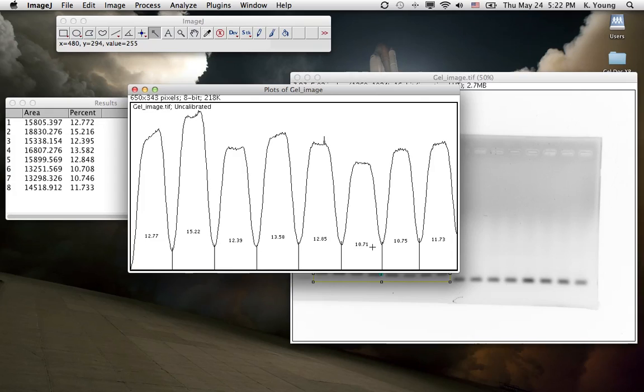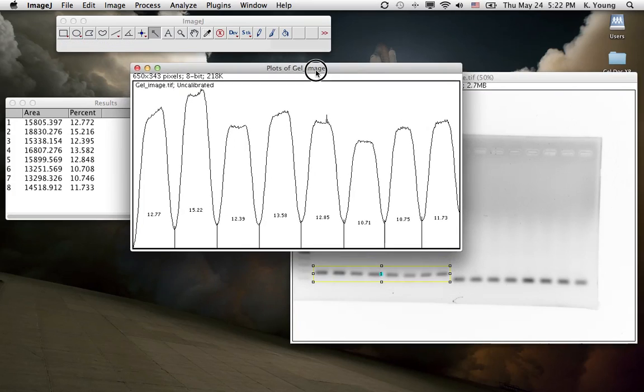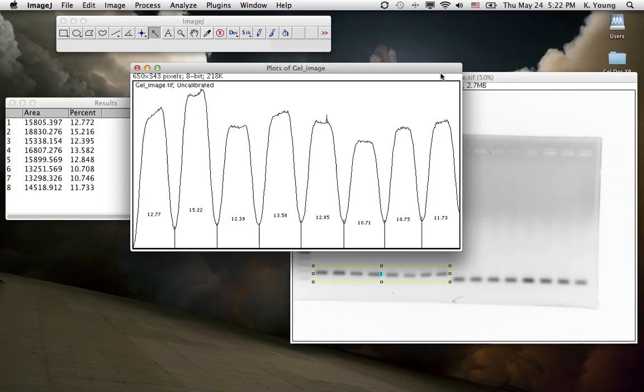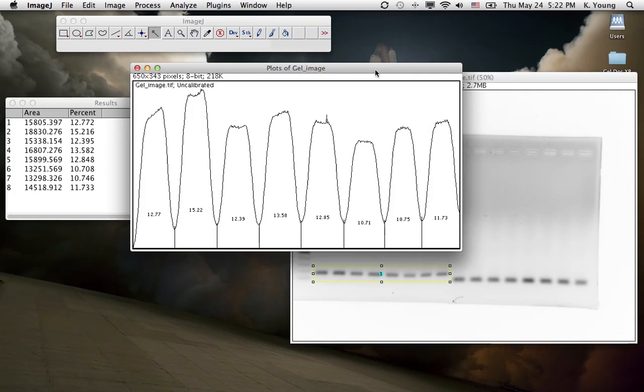Well, there you have it, folks. Just bear in mind, this is a semi-quantitative way of quantifying a gel. It's good for just quick and dirty experiments, but not good enough for publishing. Good enough to just give you a rough idea of the direction you want to go in your research. All right, good luck with this.